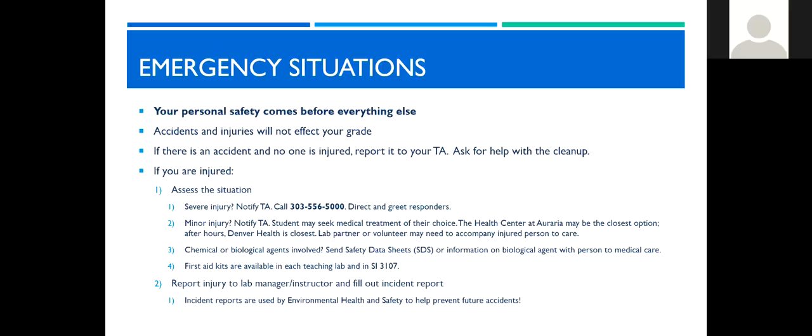If there is a chemical or biological agent involved, send the safety data sheet or information on the biological agent with the person to medical care. First aid kits should be available in your lab and in the room SI 3107. Please report all injuries and accidents to your lab manager, your instructor, your TA, and EHS will do their best to try to prevent future accidents from happening.